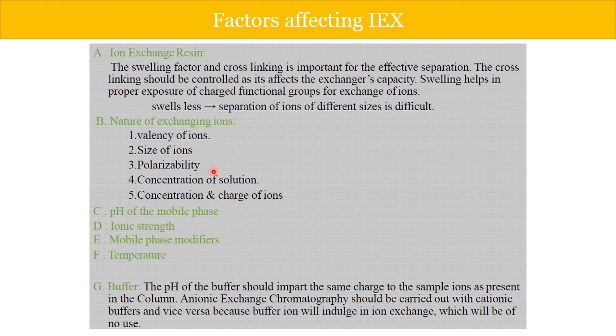Out of this, mainly you have the resin, then the nature of the exchanging ions which you would be using, definitely the pH, the ionic strength, and temperature plays a role also, and you know about buffers.